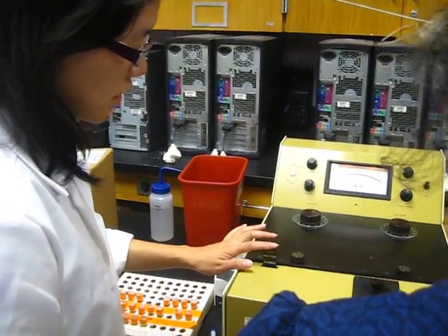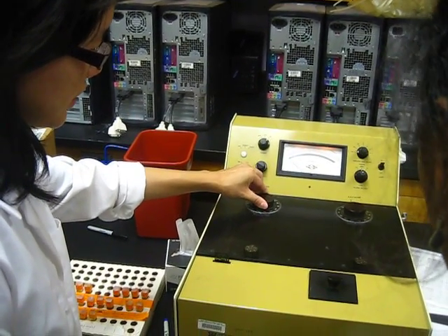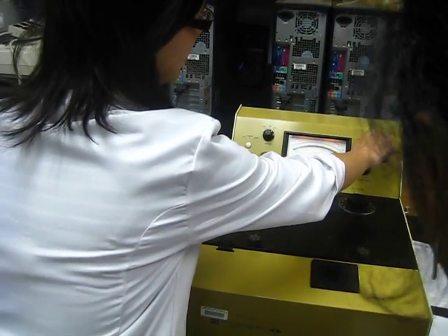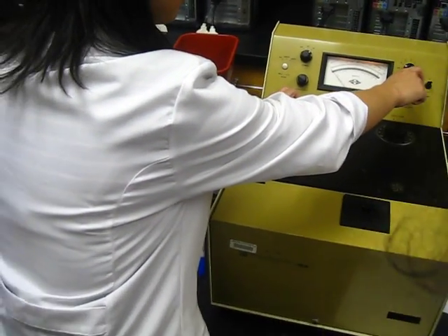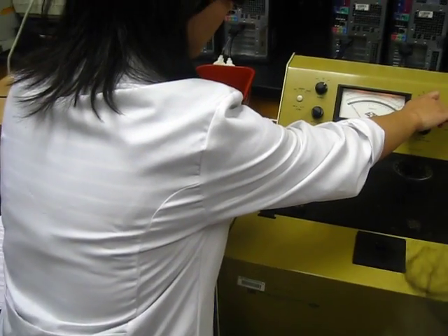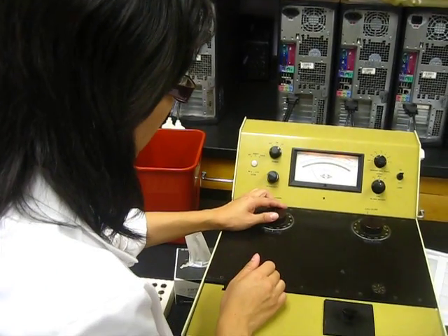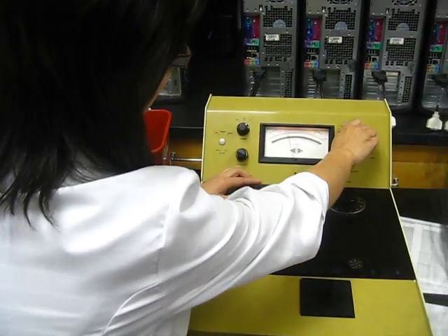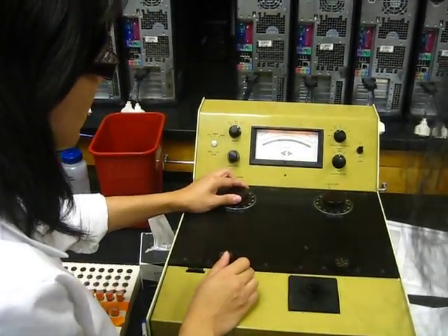Then we will open the shutter. We will change the wavelength a little bit. We found that the needle doesn't move at all, so we just change the percentage scale, increase some sensitivity. Still doesn't work. Okay, let me choose 3. Okay, 3 seems good. Or we can just choose 1. 1 seems too strong, so let's choose 3.